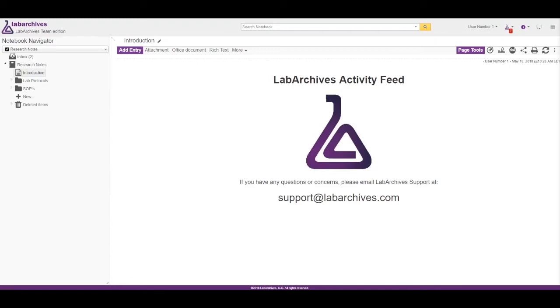The Activity Feed is a great way for instructors, students, or lab managers to quickly see activities or changes made to a notebook.